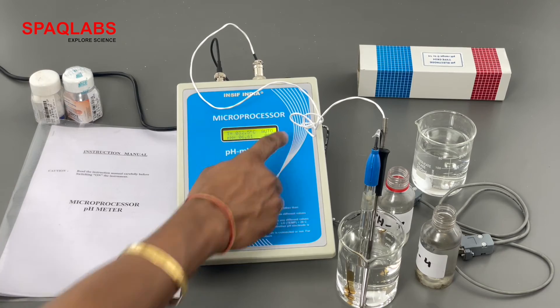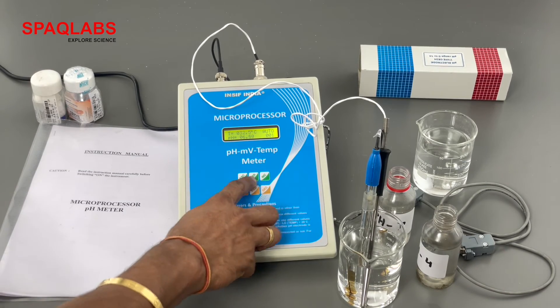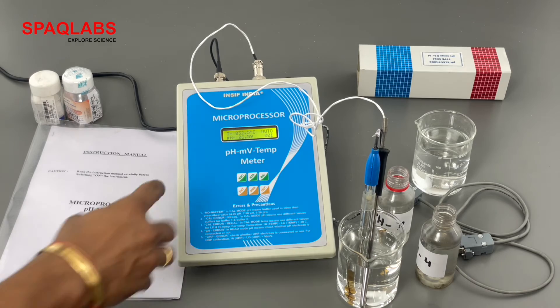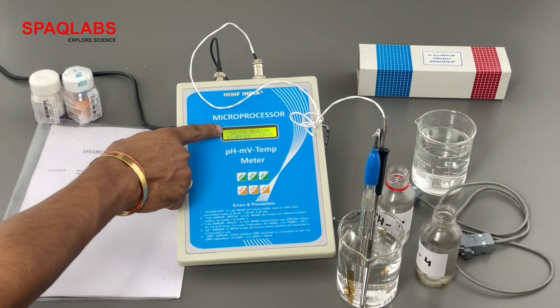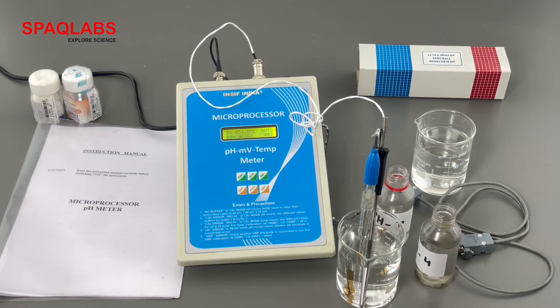The memory location is shown on screen, where you can save the data by clicking the store button. Wait for the reading to stabilize — about 1 minute. Once it is stabilized, press the store button. It then says 'saving reading' along with the time and date, and the reading is saved.